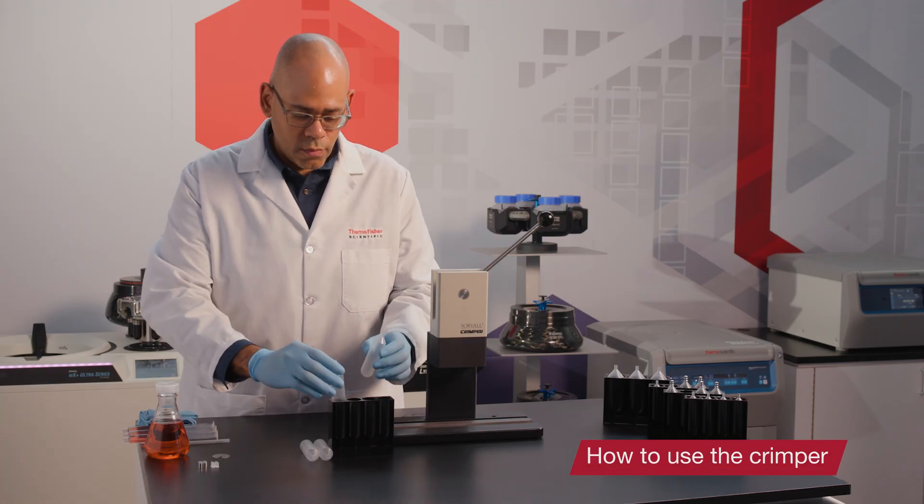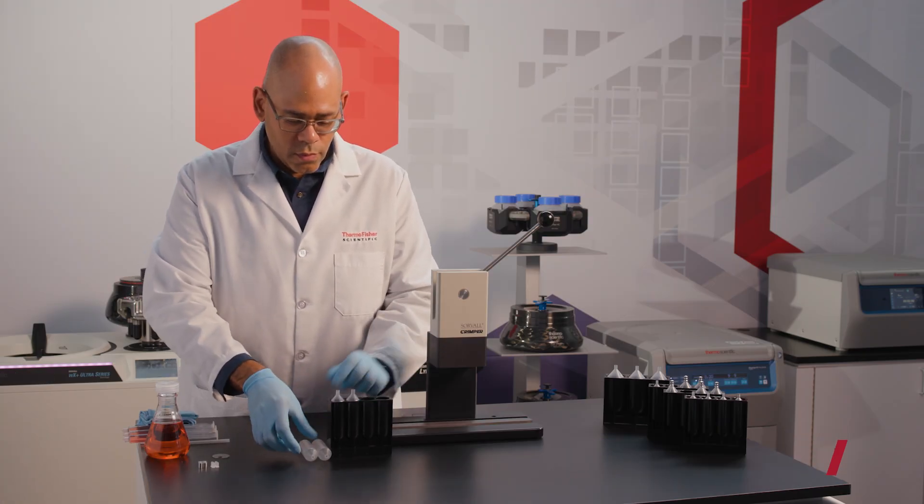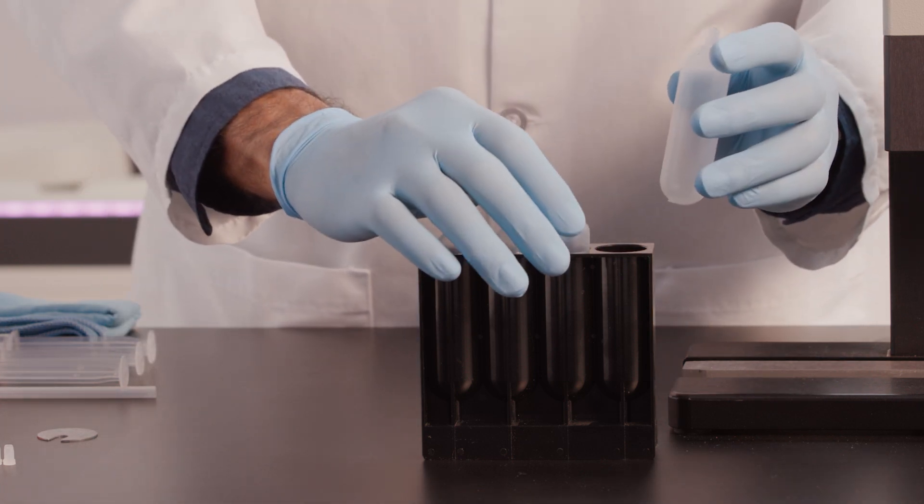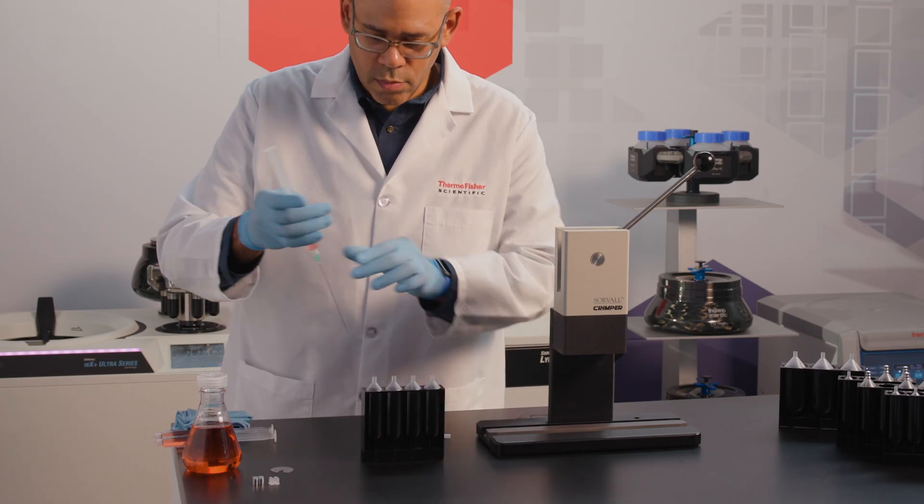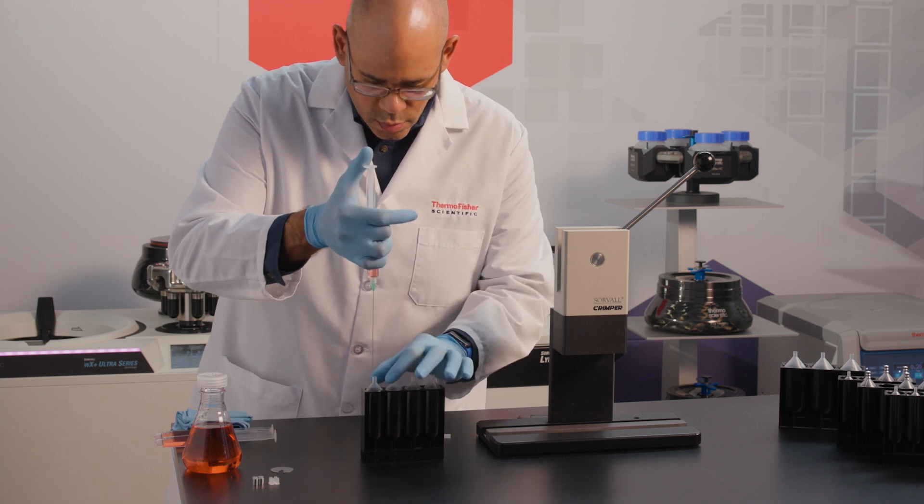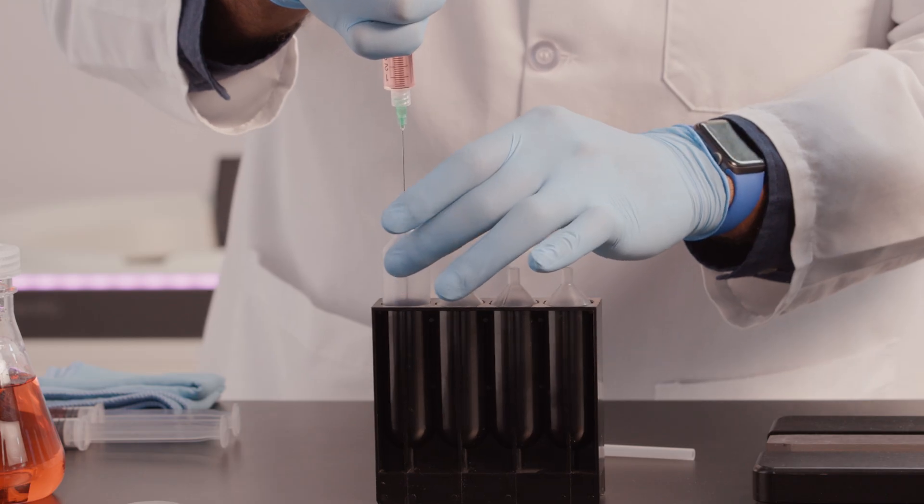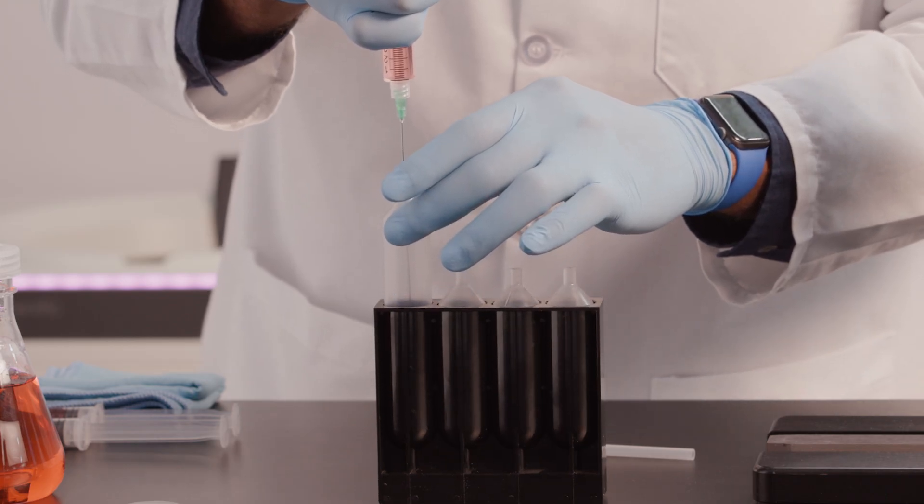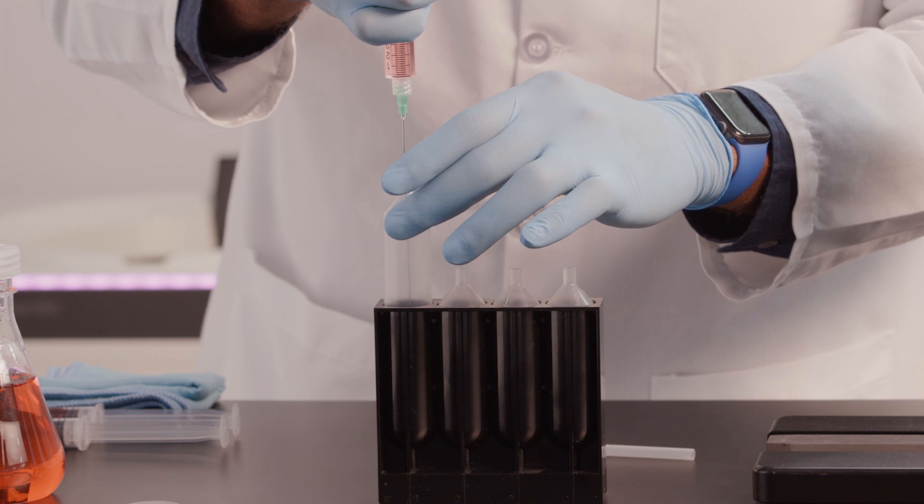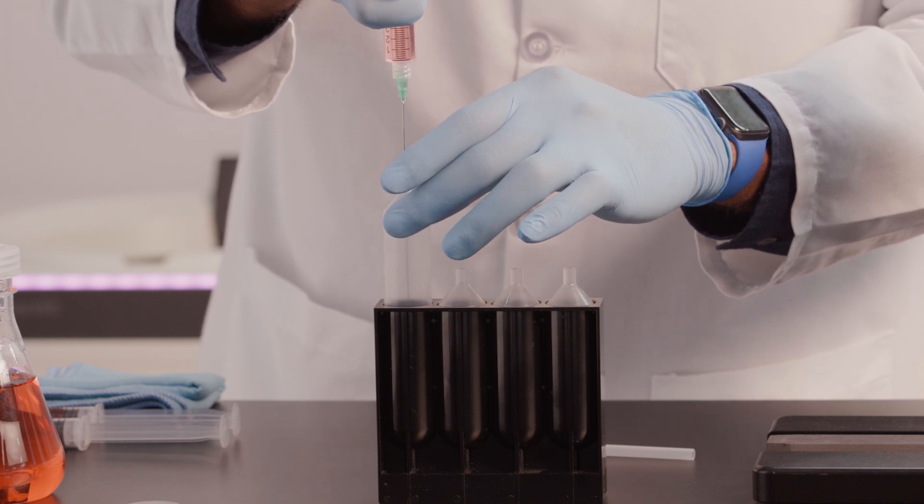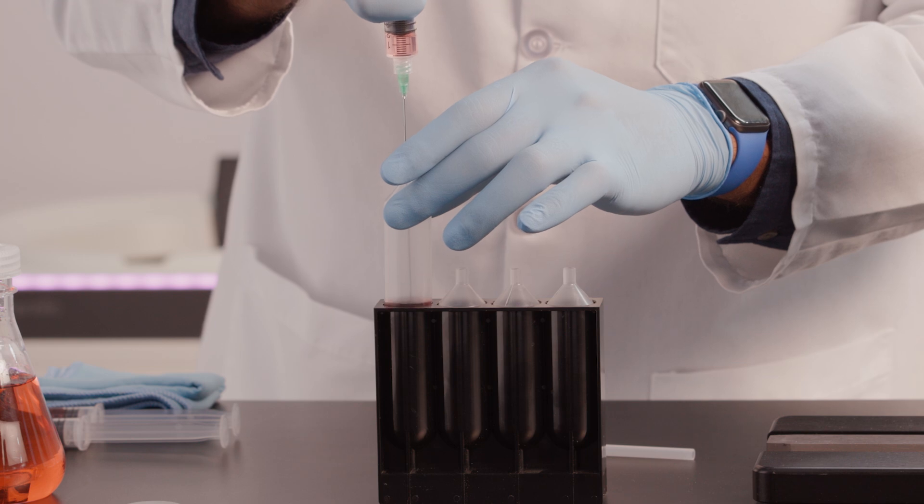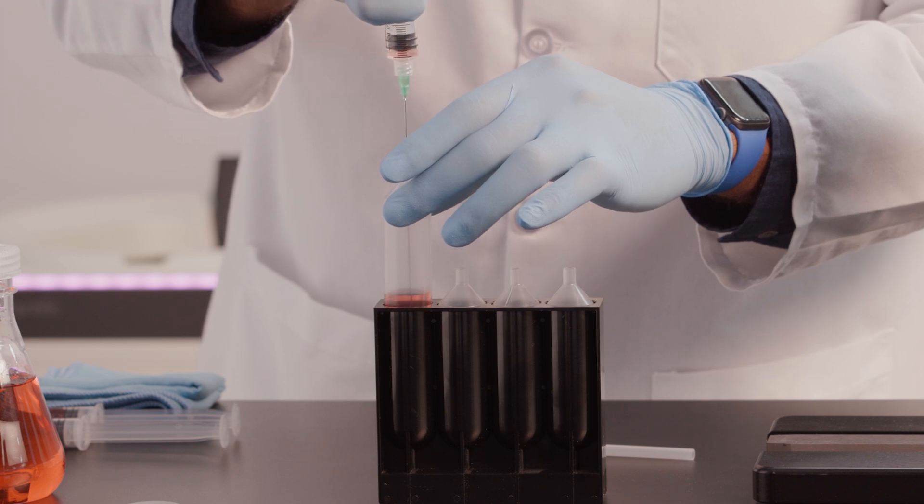To start, place your tubes into an appropriately sized tube rack. Add aqueous solutions or homogeneous mixtures of sample and gradient reagents to the tubes using a syringe or a pasteur or transfer pipette. Load the solution at a moderate rate to avoid forming bubbles on the inside wall of the tube.